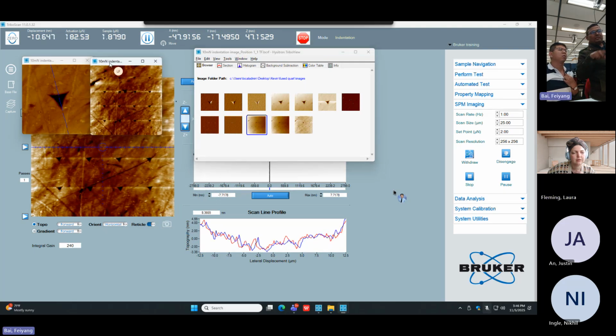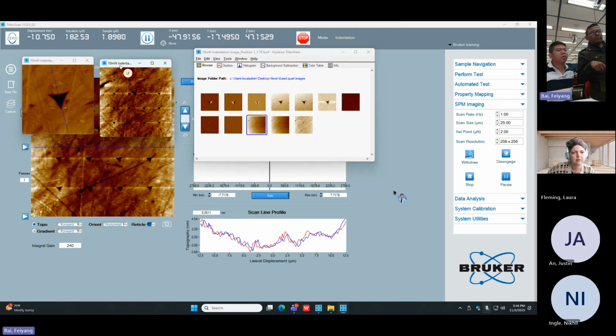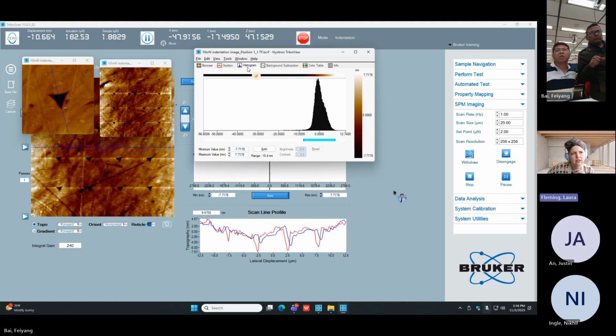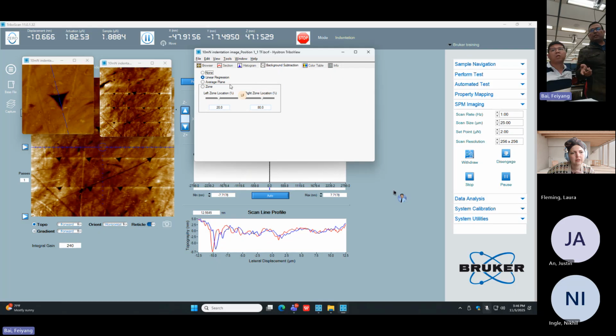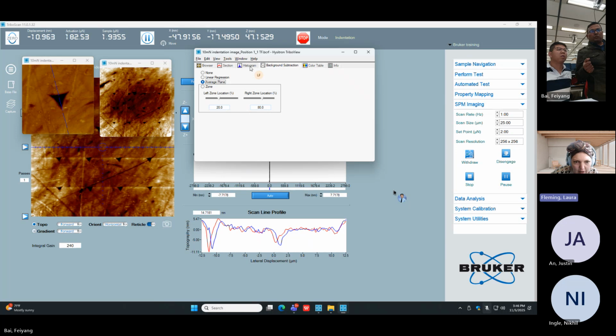What format is it saved, this property mapping? I think it's still a .hys file, because it treats it as a singular indent file. So we can recall it when we want to see that or visualize that or map that property, right? Yep, absolutely.